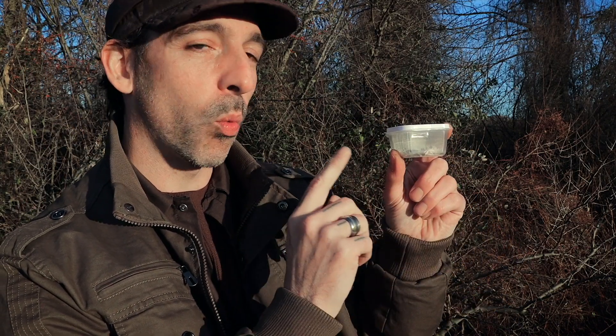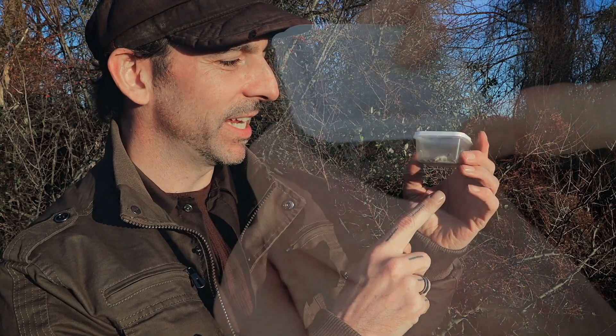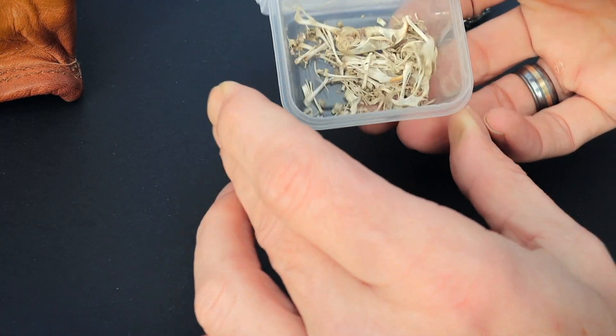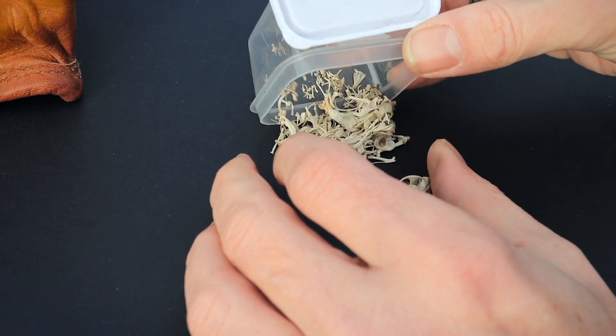By the way, this is the container of all the bones I got out of just one pellet. That is awesome. There are a ton of bones in here and they're very clean. I can't wait to show you. How are you guys doing? I'm Chris Ignato and you are watching Nature Here and Now.